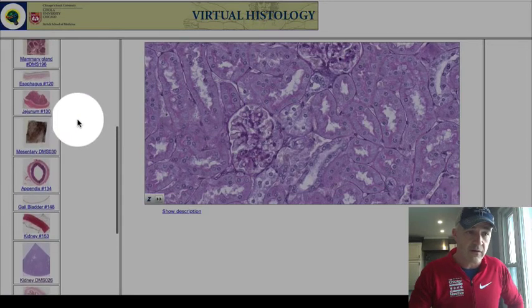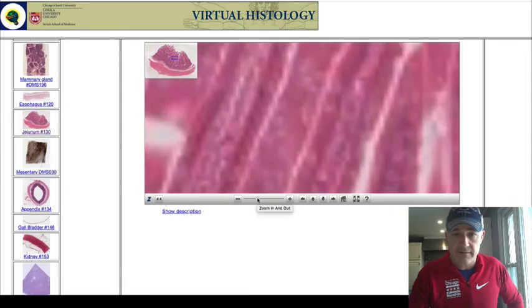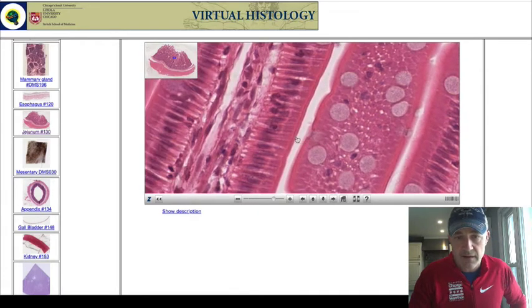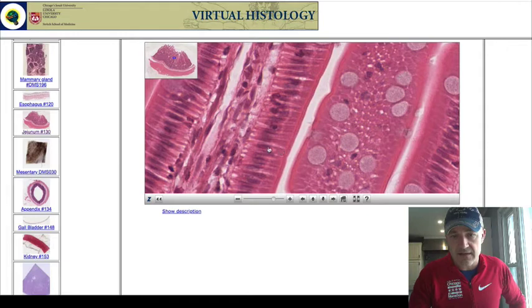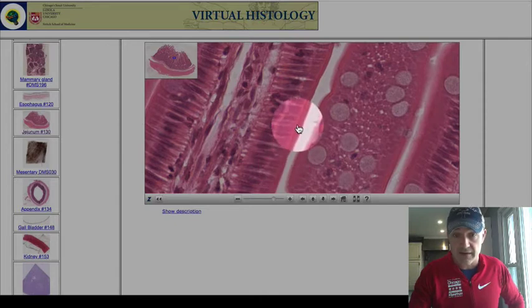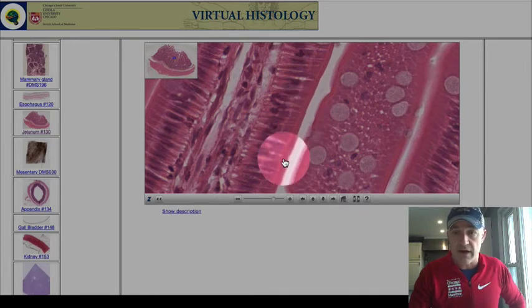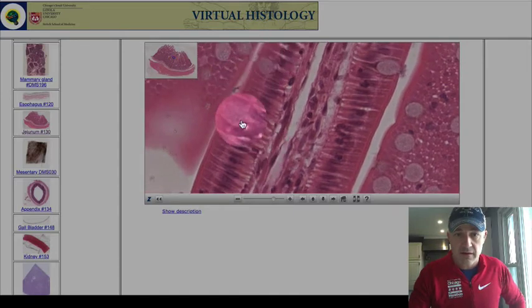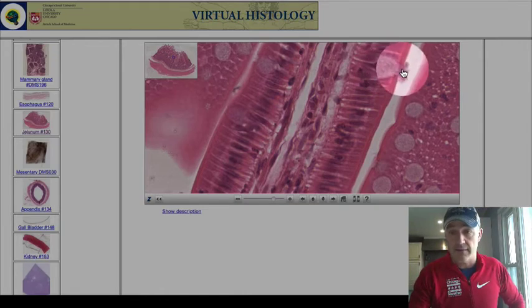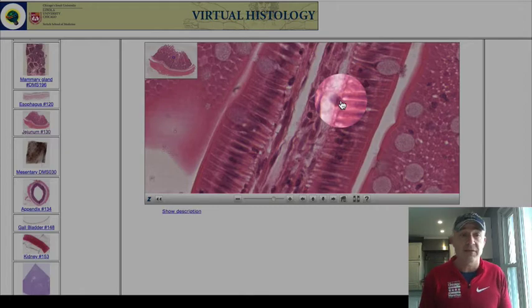Moving to the jejunum slide, zooming in on the tips of the villi — you can see tall, skinny cells with the nucleus closer to the bottom. That is simple columnar epithelium, with microvilli on the surface. Looking around a bit more, you can see mucus-producing cells — those are goblet cells. Here's a perfect view of one actually releasing mucus. That goblet cell is something I'd like you to be able to identify.